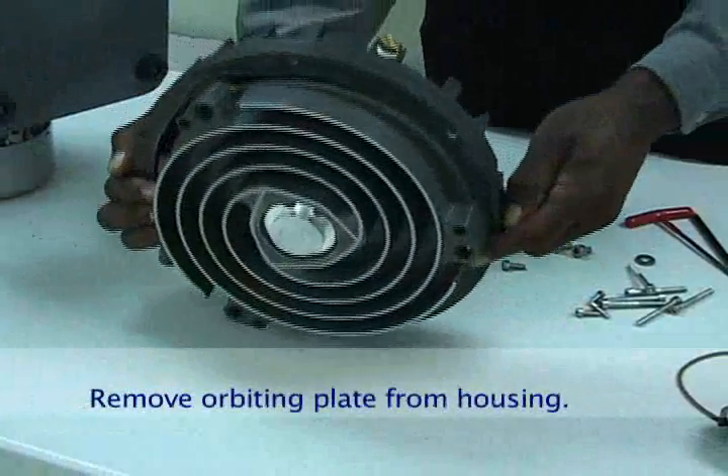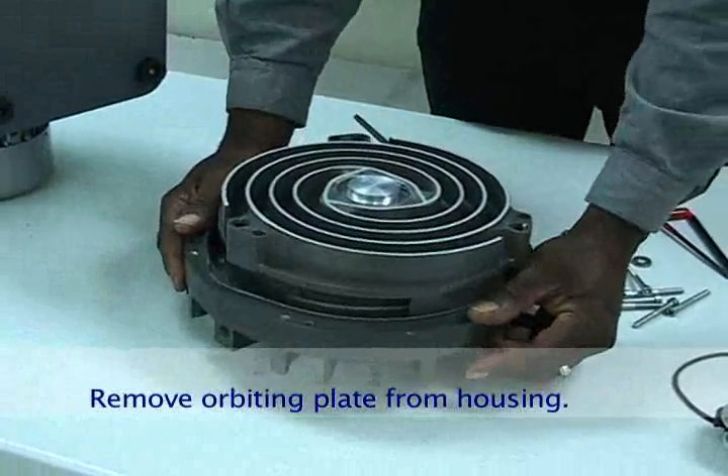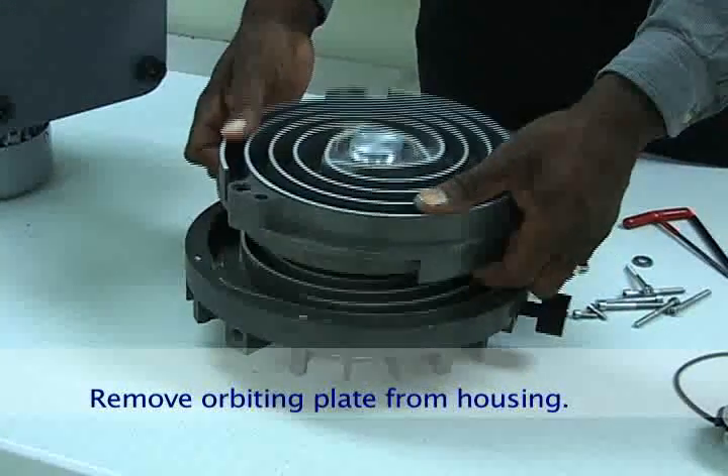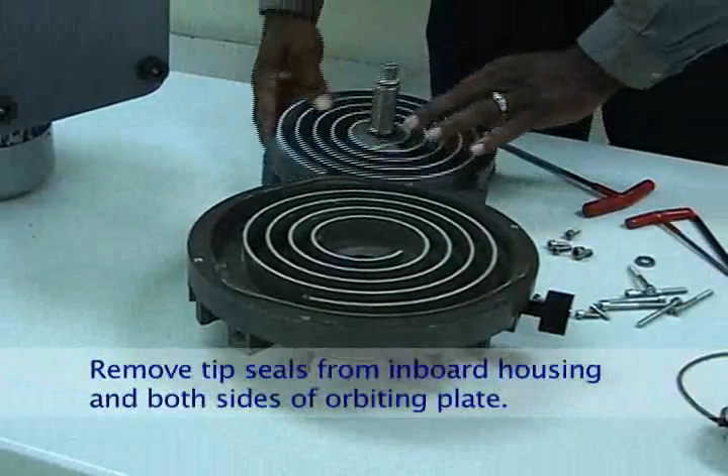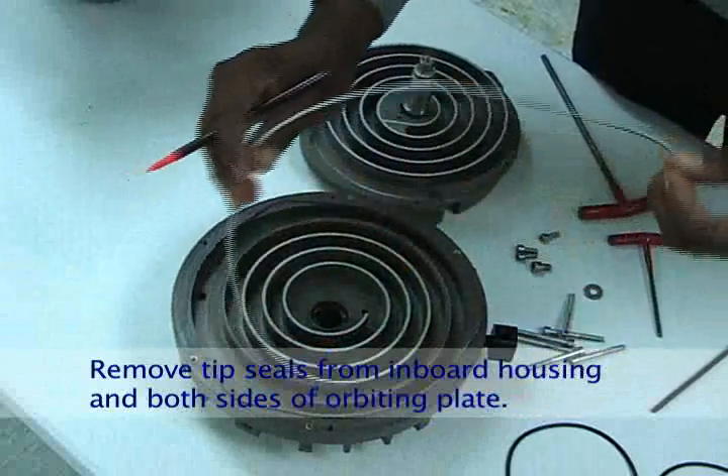Turn the inboard housing over and lightly push the shaft on the table to remove the orbiting plate from the housing. Remove all the tip seal sections from the inboard housing and both sides of the orbiting plate.